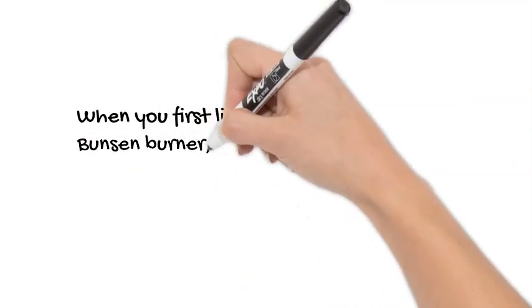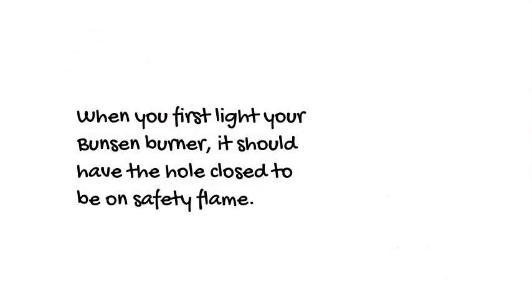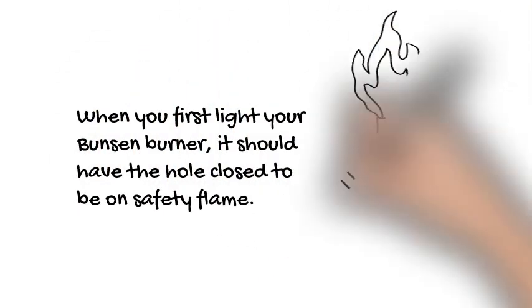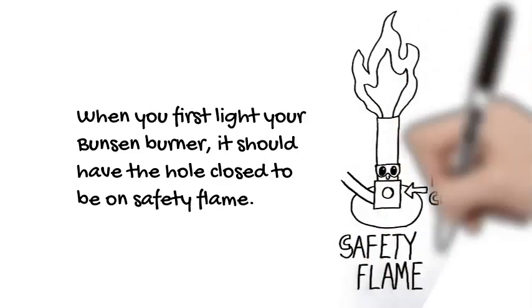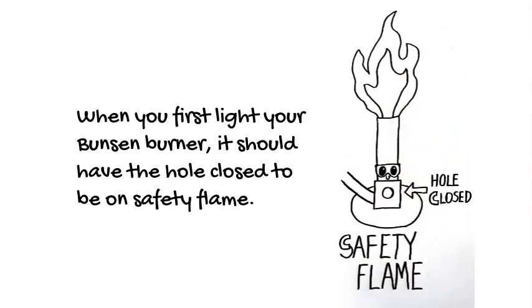Before you light your Bunsen burner, make sure the air hole at the bottom of the barrel is closed. This will produce what's called the safety flame, which is orange and easy to see.